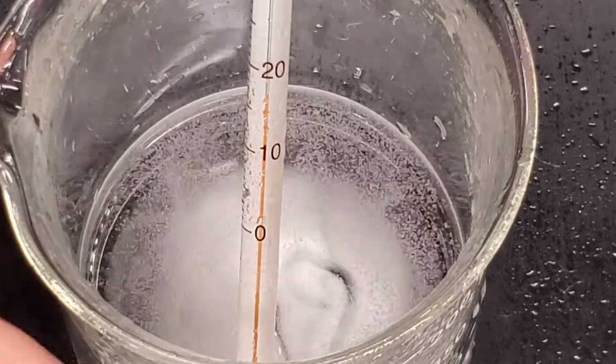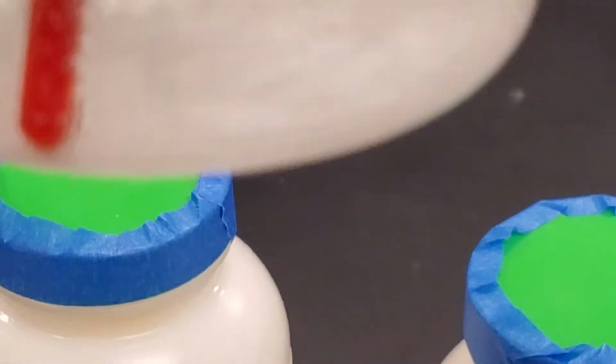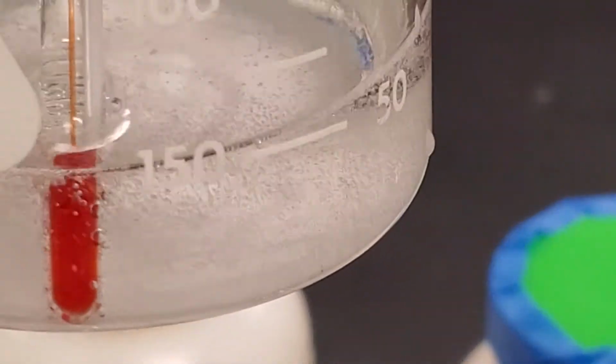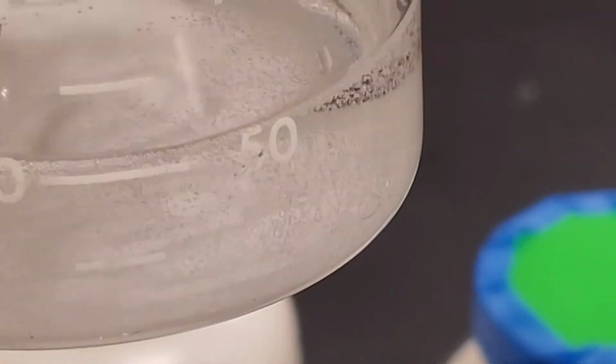While we're waiting for this minute to finish up, let's take a look and see if we see any major changes from what we would expect. Still appears that the liquid is clear. We do see bubbles. And there is a little bit of a white powder down at the bottom.